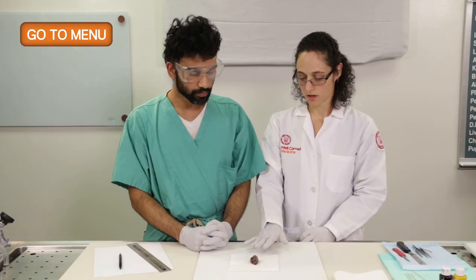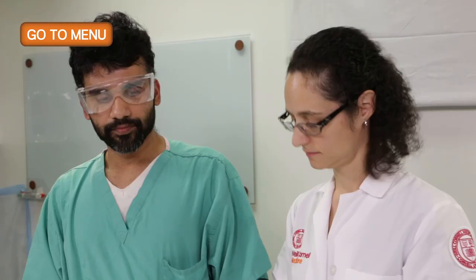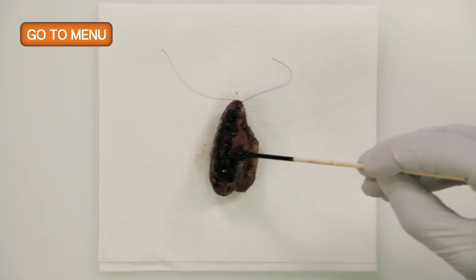So now we've gone over orientation, examination of the external surface, and taken all our dimensions and our weight. The next step is inking. So we ink the specimen. We'll go ahead and ink the lobe. I'm basically going to be inking the capsule black, and then the isthmus yellow when I get to it.